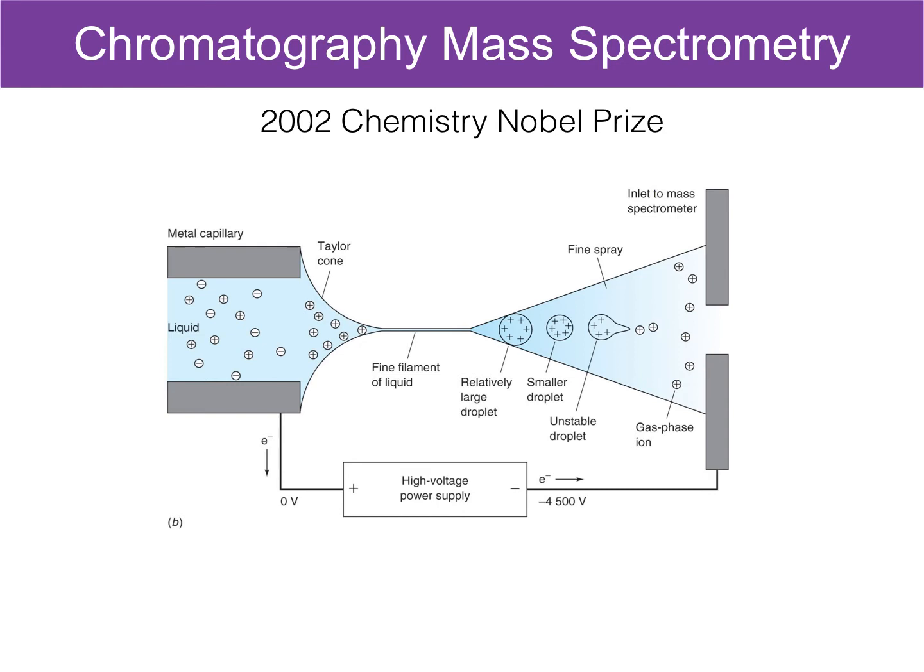And so basically what happens here is that the liquid gets sprayed in through a filament, which creates these droplets that are charged. And as these droplets move along, these droplets break apart, and eventually, before it hits the mass spec, we basically have gas phase ions because these droplets have broken apart into such a fine mist that we have statically charged ions.